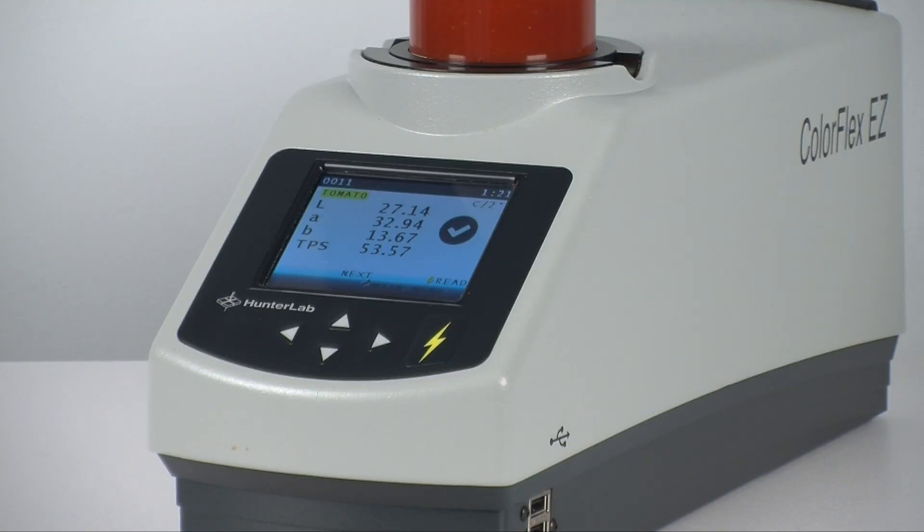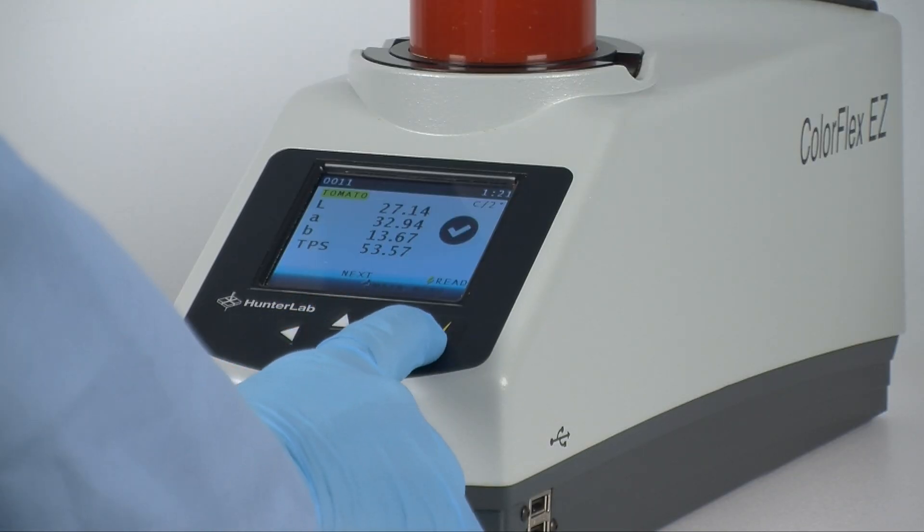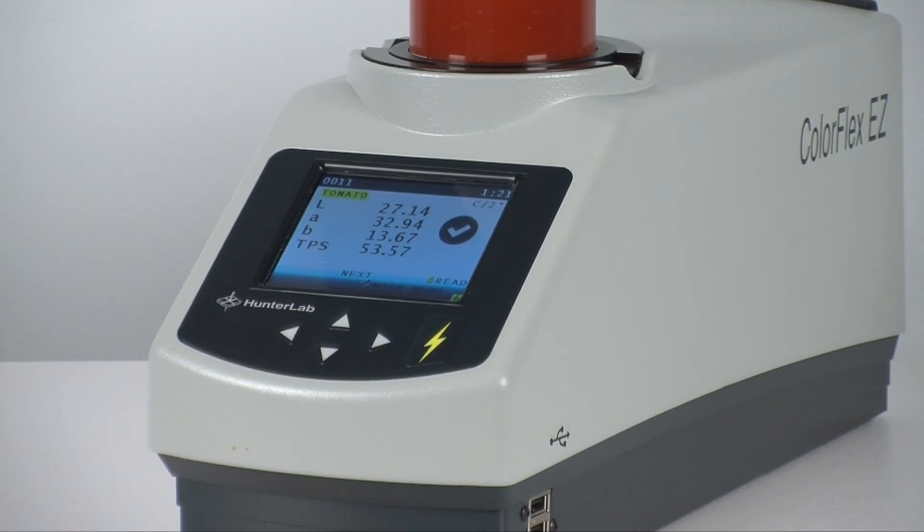Press Read to measure your sample. In less than four seconds, you'll see the default view for tomato measurement values: LAB and TPS, or tomato paste score.